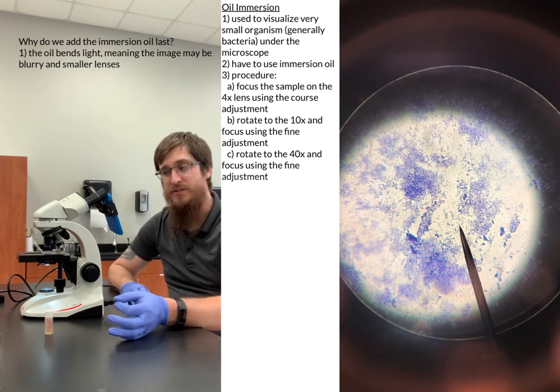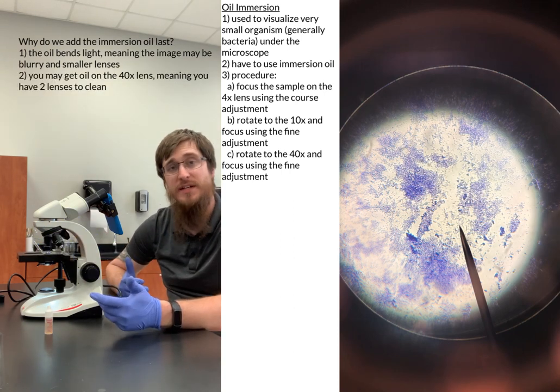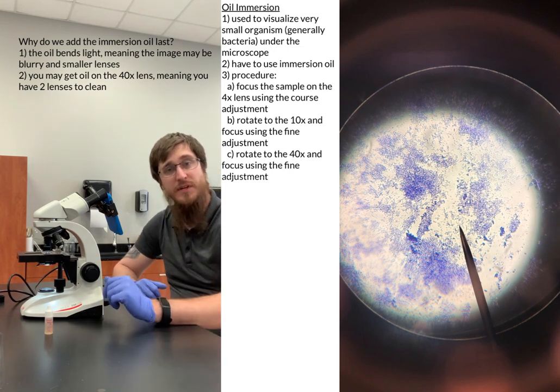And the other big thing is that you might get it on the 40x lens and now you have two lenses to clean at the end. So we don't really want to do that. Now, I'm going to assume again that I'm ready to go.